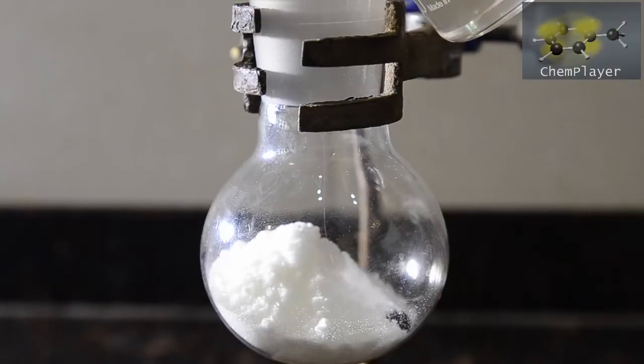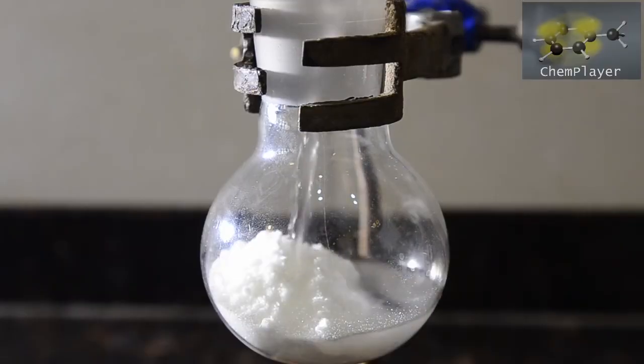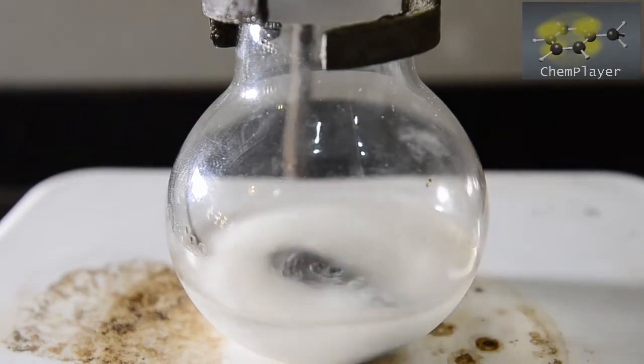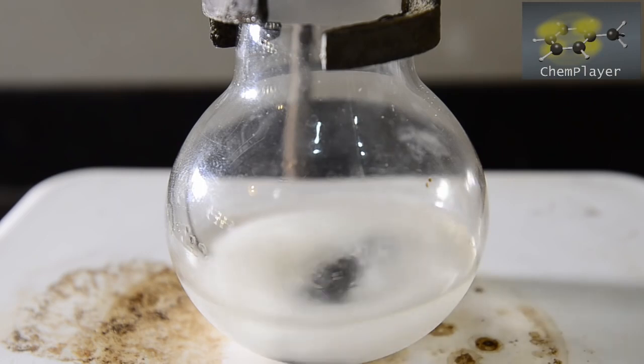Then we added this solution to the vanillin in the flask, and then got it stirring to dissolve. There was no color change observed.